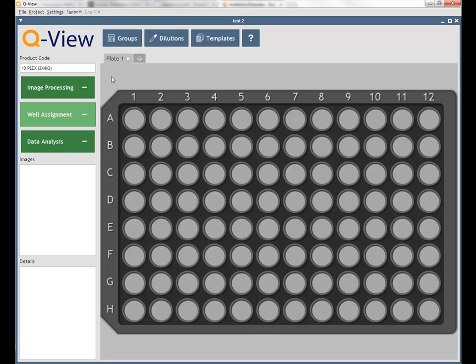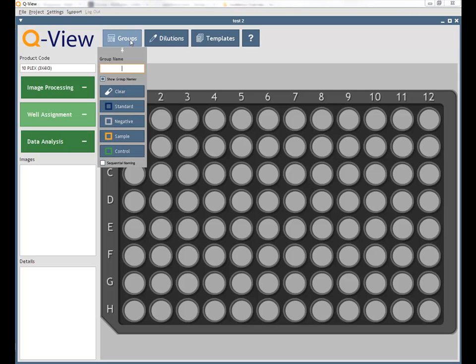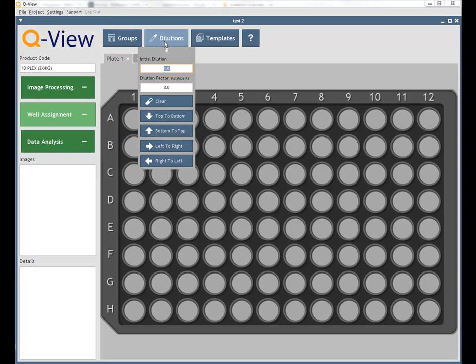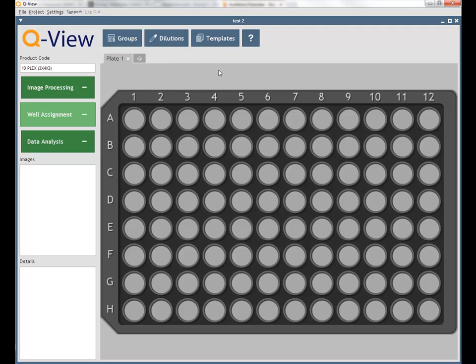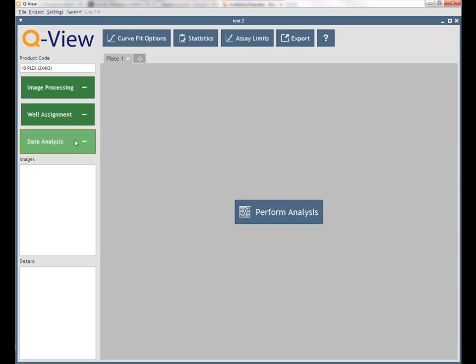In well assignment, users can assign groups, name wells, and apply dilution factors. During data analysis, users can customize and export generated concentrations, statistics, and charts.